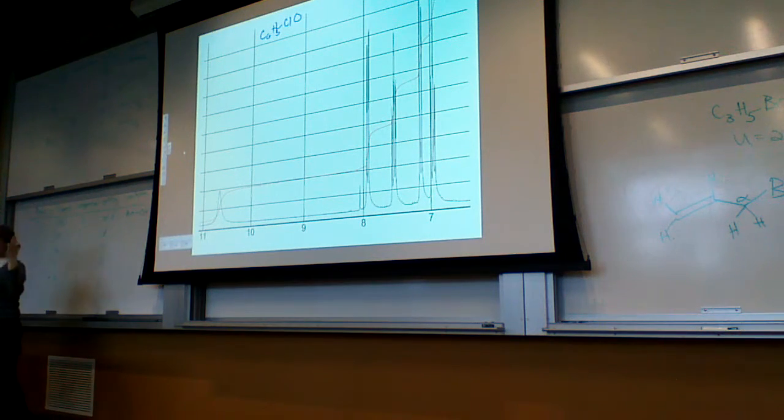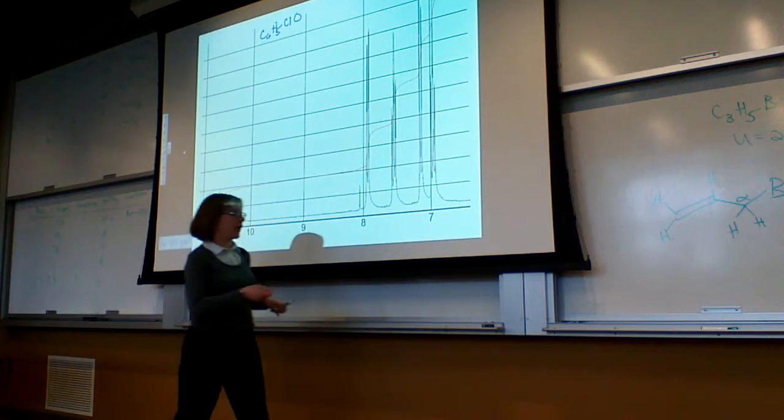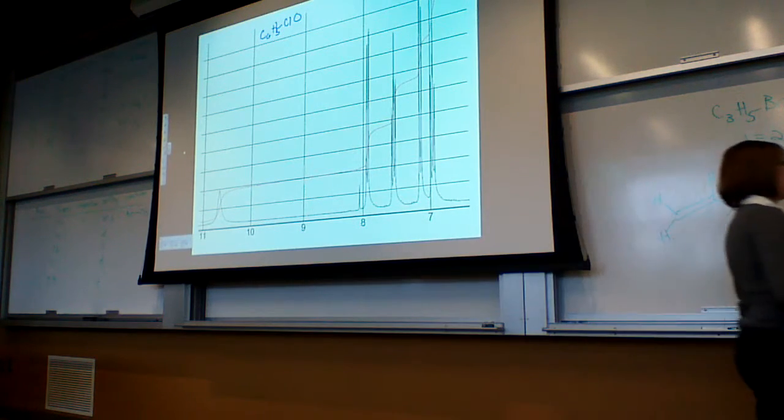Also, the chemical shift is high for an alcohol, so it's a phenol rather than an alcohol, which often has, say, a CH3 or a CH2 group. Yeah, it's a phenol. Then we have the 4 peaks in our aromatic region. They are going to tell us what type of substitution pattern we have on the aromatic ring.